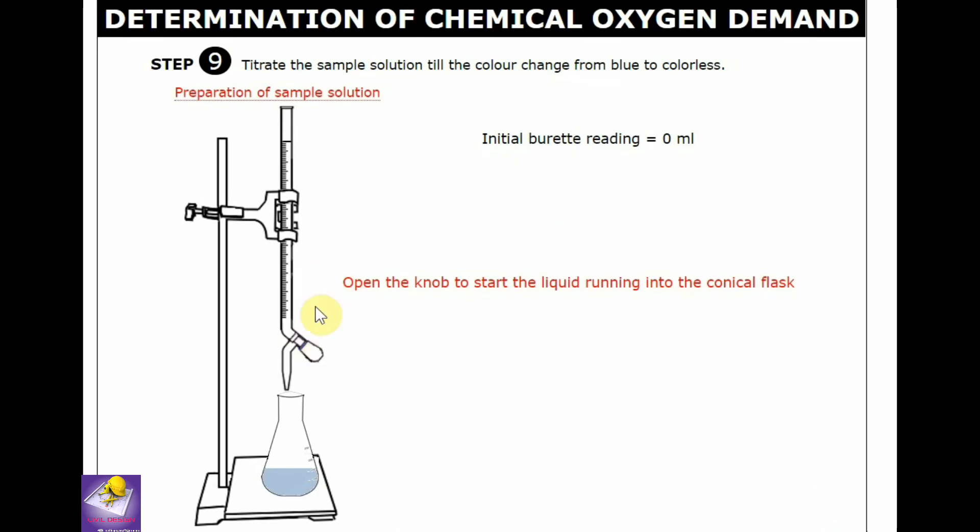So let's start the titration to that solution till the color changes from blue to colorless and take the reading. When the color changes to colorless like that, that is the point. Take the reading: 8.1 ml.